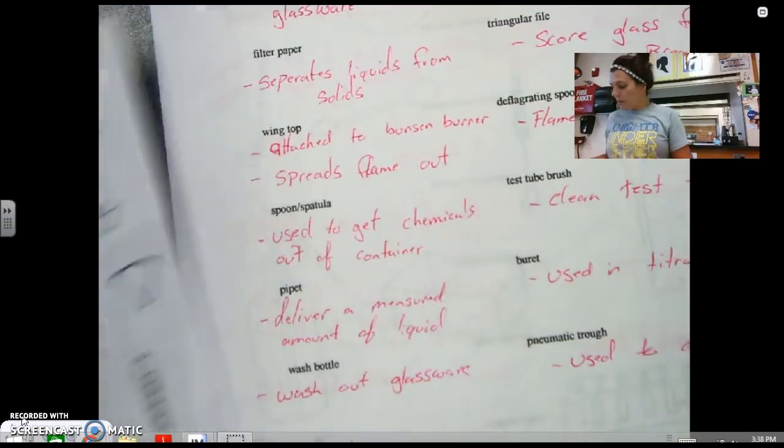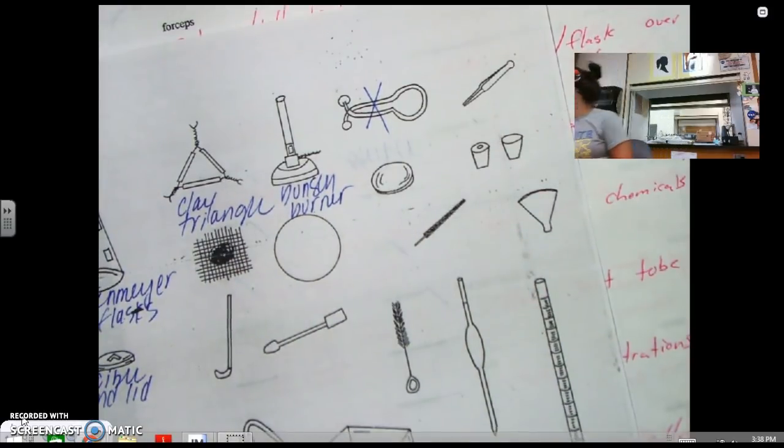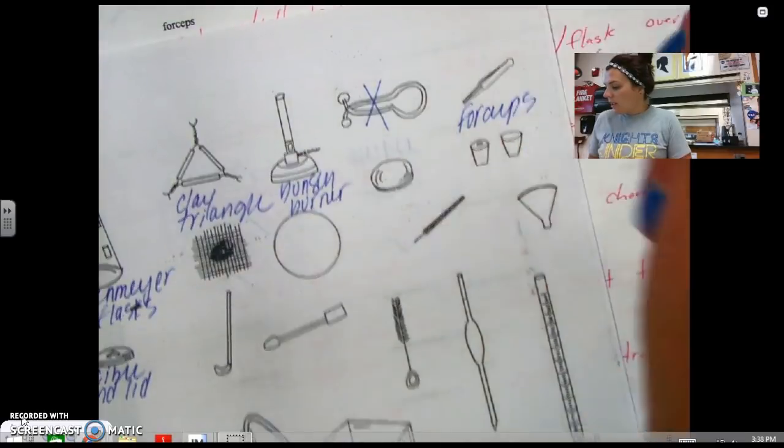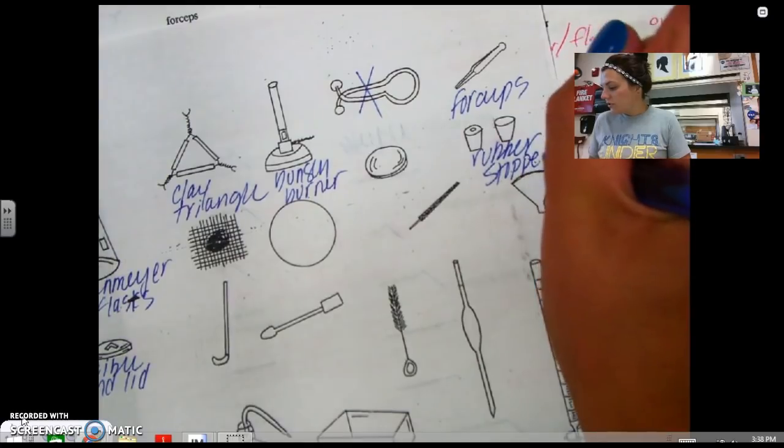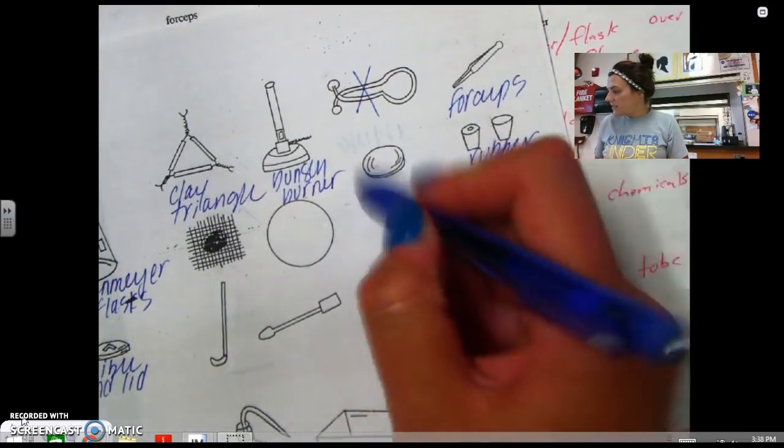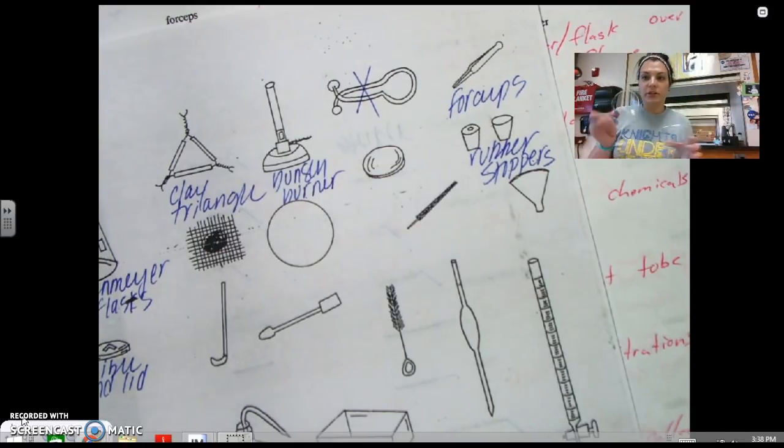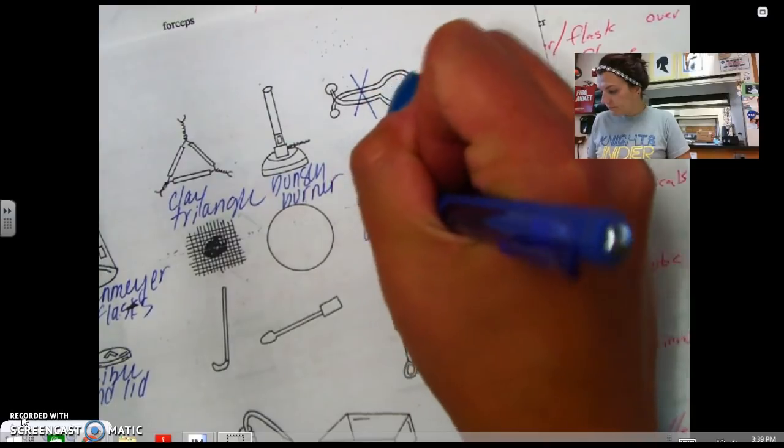We're going to go ahead and skip a couple things here. We're not going to do a pinch clamp. We can skip that. Forceps, obviously, you could probably guess. Forceps are used to pick up solids that I don't want you to touch. So those are forceps. These are rubber stoppers. They just close chemicals that we don't want going out into the air. This is a watch glass. Watch glasses, if they're the right size, especially for boiling water, we can put it over our beaker like this. So that's a watch glass.